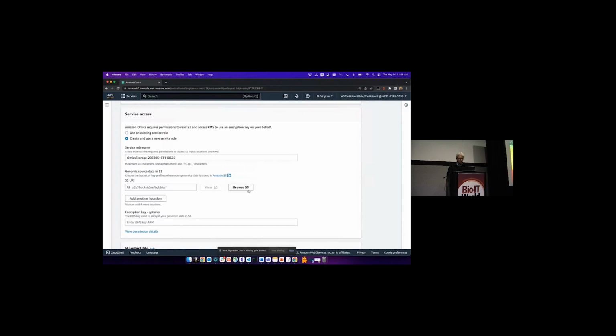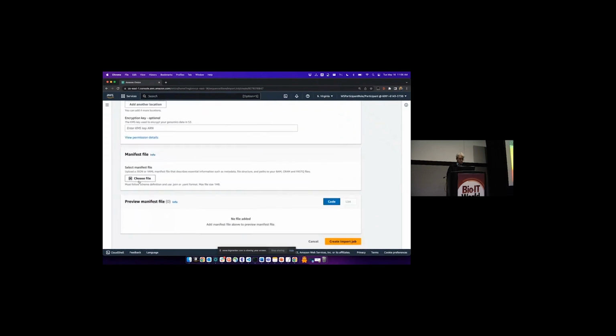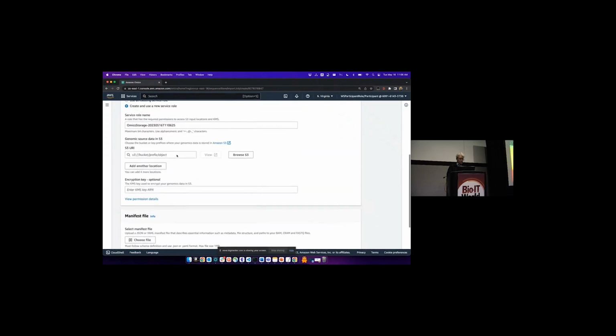So create a new service role, and in this case, we're going to use a manifest file for this.